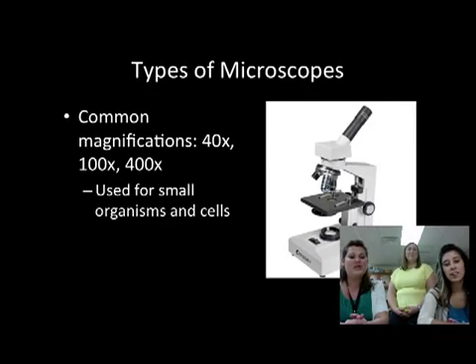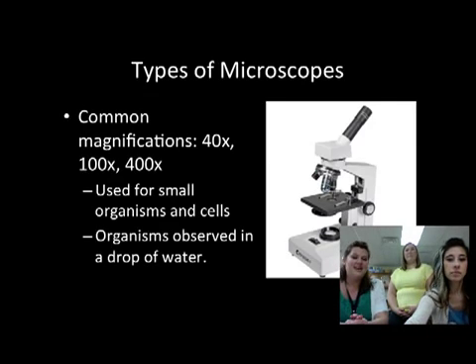These are used for small organisms and cells, a lot of the slides that we'll give you to observe in class. And organisms observed in a drop of water.